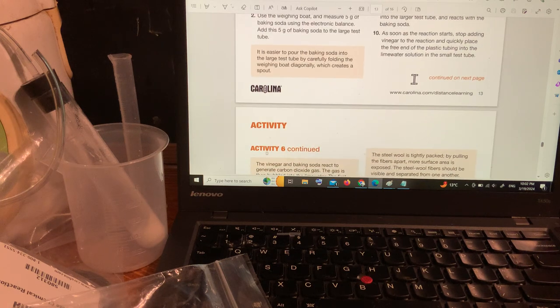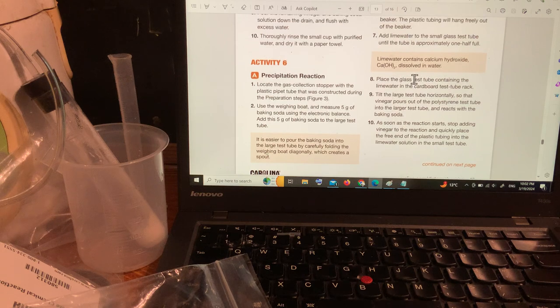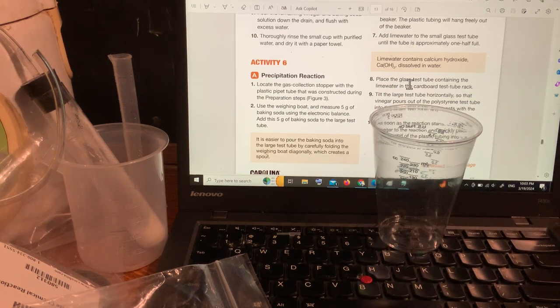Okay, so I'm going to get a small test tube and put the lime water in it. Apparently there is a cardboard test tube rack. Now, I didn't notice a cardboard test tube rack, so I prefer to just use cups. But if you find the cardboard test tube rack, that's great. For myself, I'm just going to use cups.